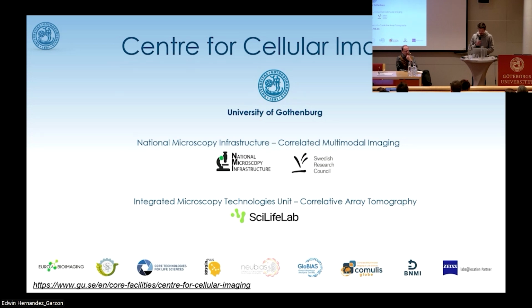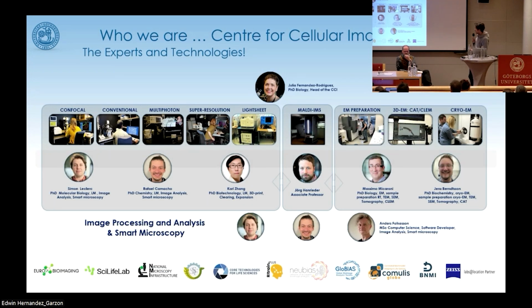But if we go right now to our services, we have quite a broad repertoire of microscopes available at the facility. In light microscopy, we go all the way from conventional confocal, passing through super resolution and also light sheet. As you can imagine, the amount of questions that we get is quite broad, and so are the requests for support. We also collaborate with a group doing mass spectrometry imaging, and we do a lot of correlative work between different modalities.